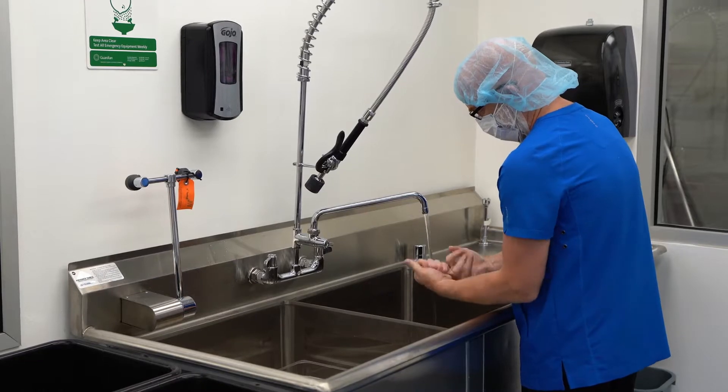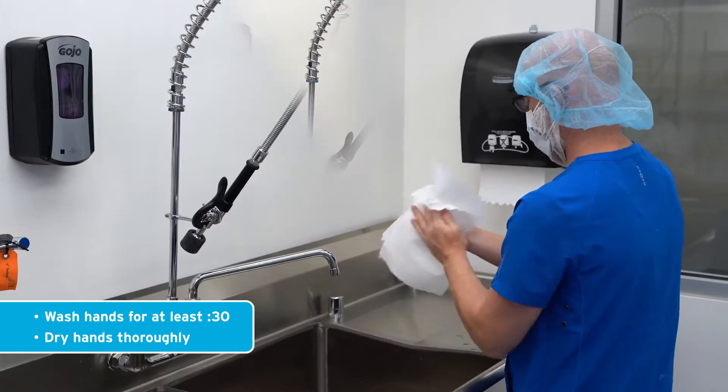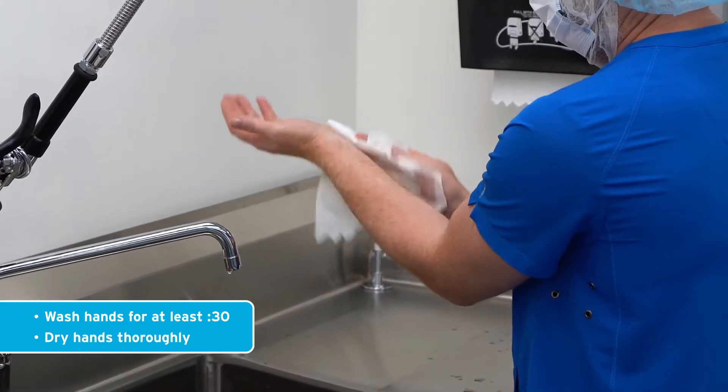This includes washing hands with soap and water for at least 30 seconds. The technicians should dry their hands with disposable towels and allow hands to dry thoroughly before donning gloves.